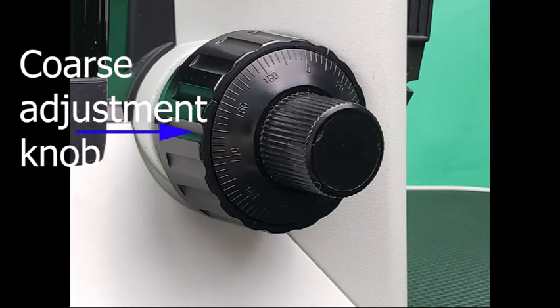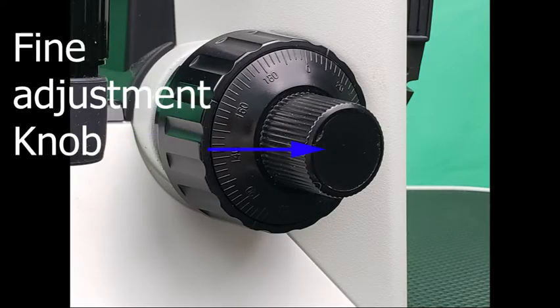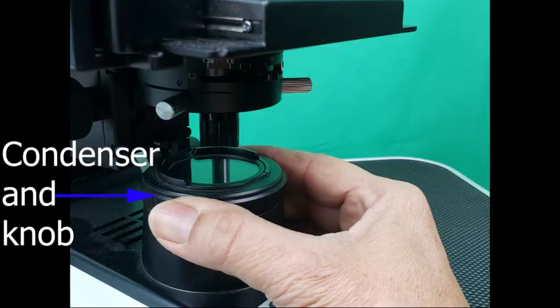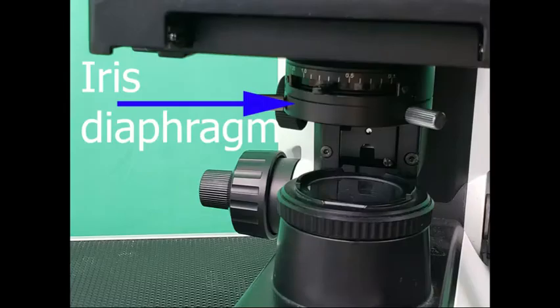Stage, coarse adjustment knobs, fine adjustment knob, condenser, condenser knob, iris diaphragm, and the iris diaphragm lever.